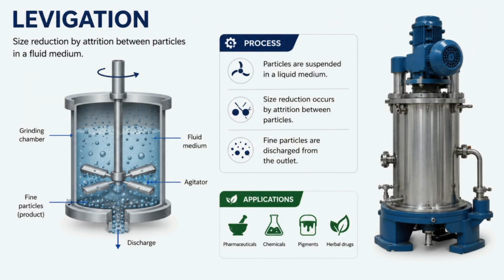Levigation. Levigation is the process of wet grinding. The material is converted into a paste with water, and then grinding of the paste is done in a mortar using a flat headed pestle. In case of large scale grinding, it is done using a colloidal mill or a mill resembling an edge runner mill. The process is used for preparation of light kaolin, chalk, red and yellow mercuric oxide, calamine and camphor, like that.